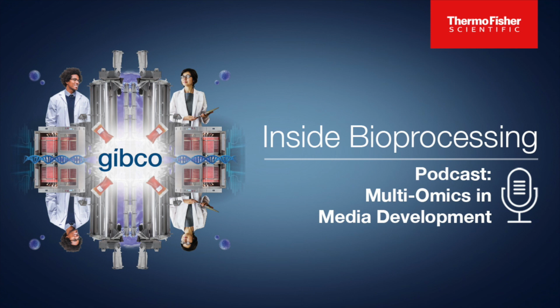We'll sample any given cell culture process for both proteomics samples as well as metabolomic samples, run them on their individual mass spec units that will give us that data set. And then once we have identified the proteins and been able to quantify what's occurring, and identify the metabolites and quantify what's occurring there, we'll then sync those two up and be able to get a model of what is actually happening in the cell.